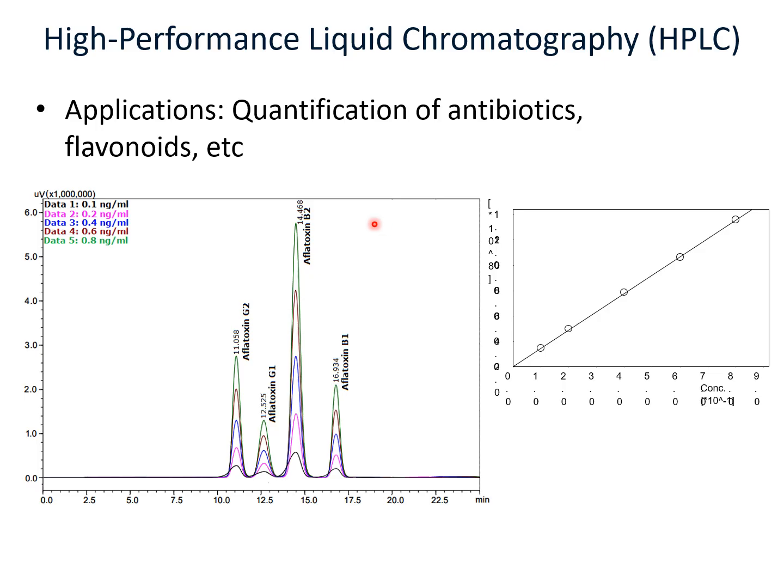So the calibration curve of the standard will now be used to determine the concentration of an unknown analyte using the same solvent system. If the analyte is present in a particular sample, when the same solvent system is used, it produces peaks at various points representing any or all of the analytes, and the concentration of the unknown analyte will be automatically calculated by the HPLC software using the calibration curve equation.